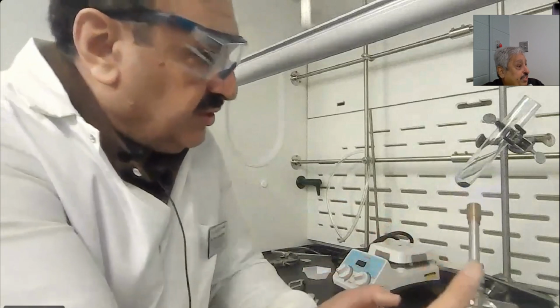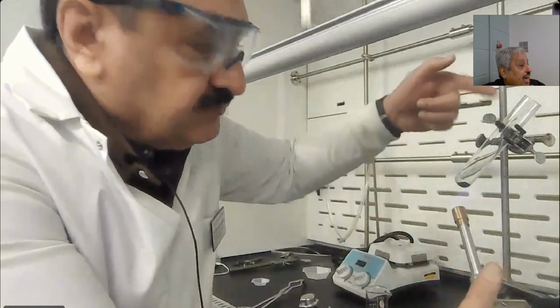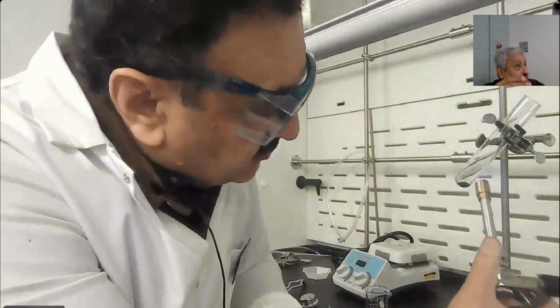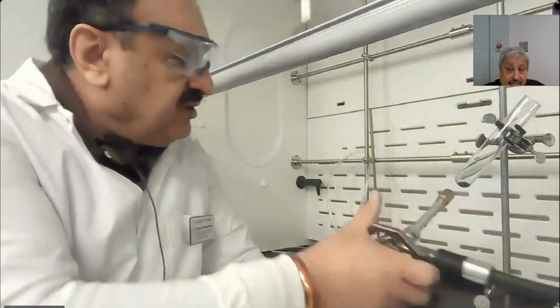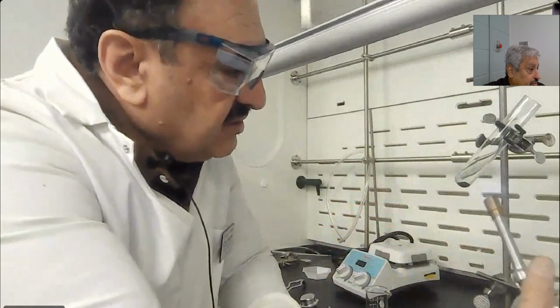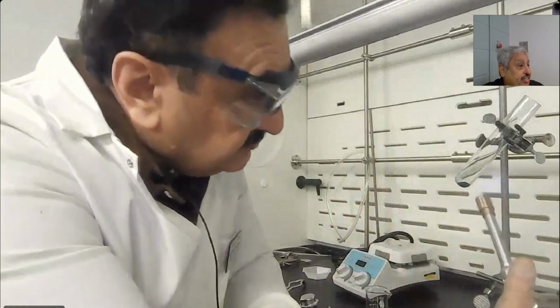What's the purpose of heating? To get the moisture out of the manganese oxide. Make sure all the manganese oxide is dry, the side of the test tube here. 5 minutes will be enough to drive off all the moisture, H2O. So we make sure that it's really dry.